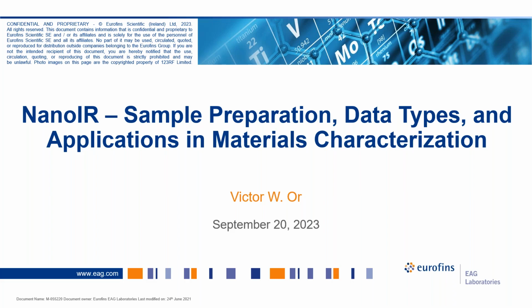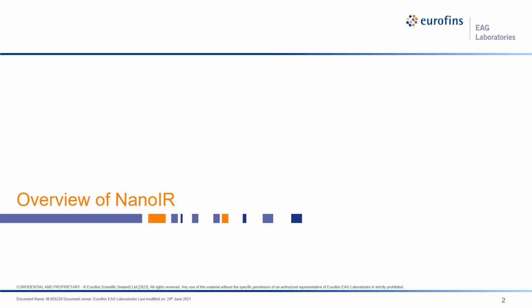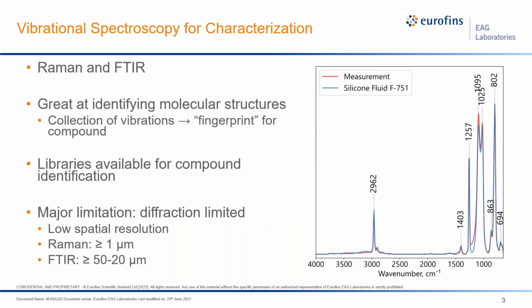I'll be discussing some different aspects of nanoIR, focusing mainly on different types of sample preparation, some of the data types that come out of the instrument, and then go briefly into some of the applications of this new technique in materials characterization. So I just want to take a step back and do a quick overview of nanoIR just to give everyone a quick introduction and get them up to speed.